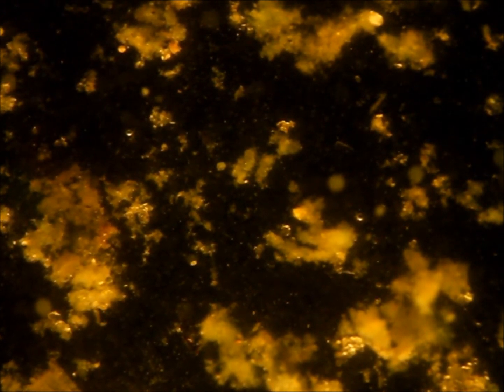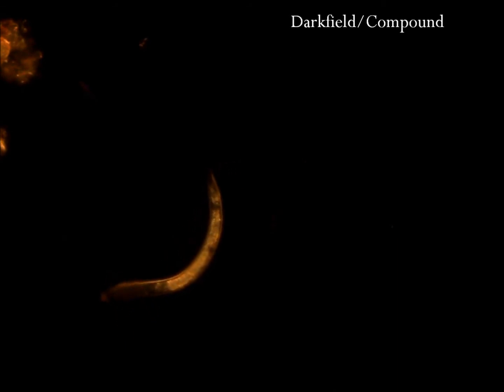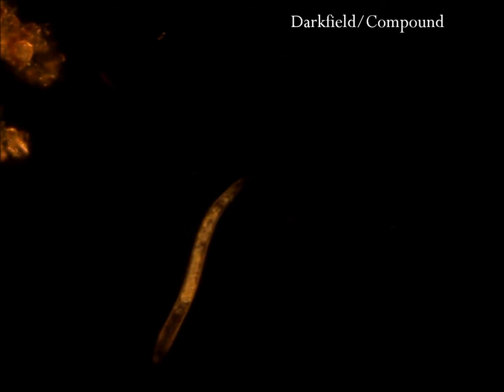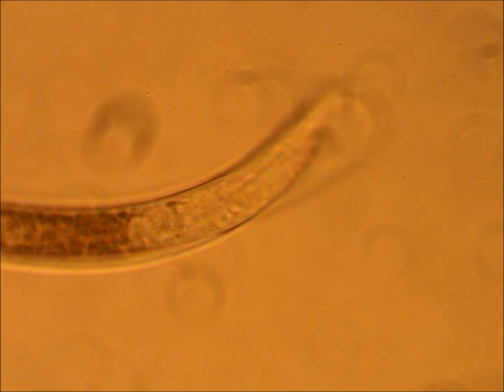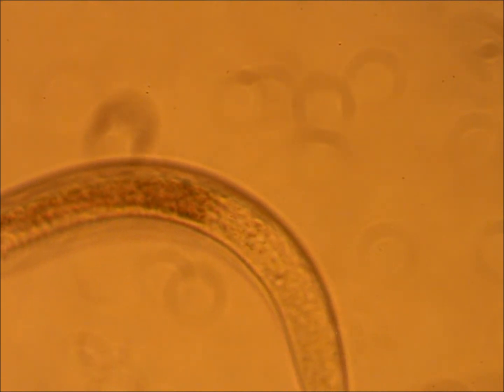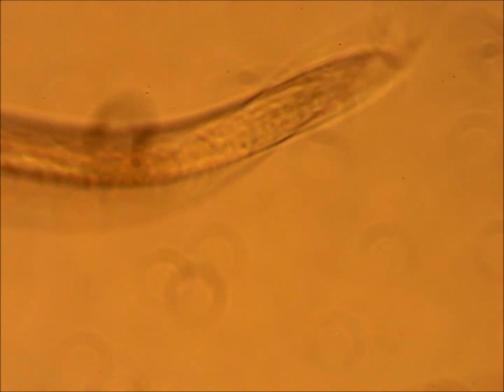We'll call her Rose, slowly undulating in the circled region. Rose is a nematode. No, not like the ones from SpongeBob. Nematodes, like Rose, move around by wiggling side to side like Ariana Grande, but much less stunning. They are very simple in structure, having two nerves that run down the length of the body that allow them to move in their signature fashion, and a simple gut cavity that runs the entire length of the organism.